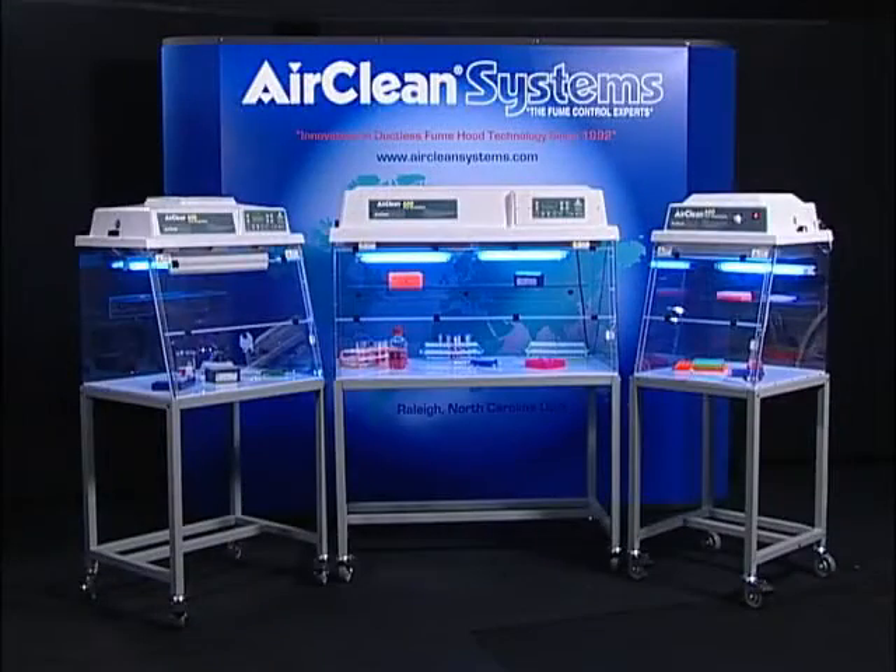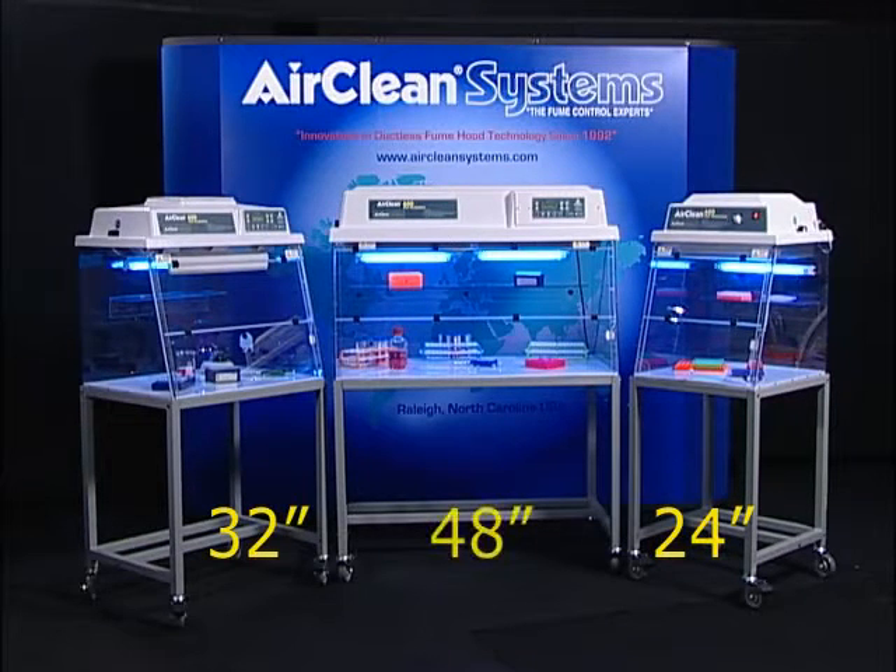AirClean Systems dead air boxes are available in three sizes: 24, 32, and 48 inch width, with a standard depth of 24 inches.